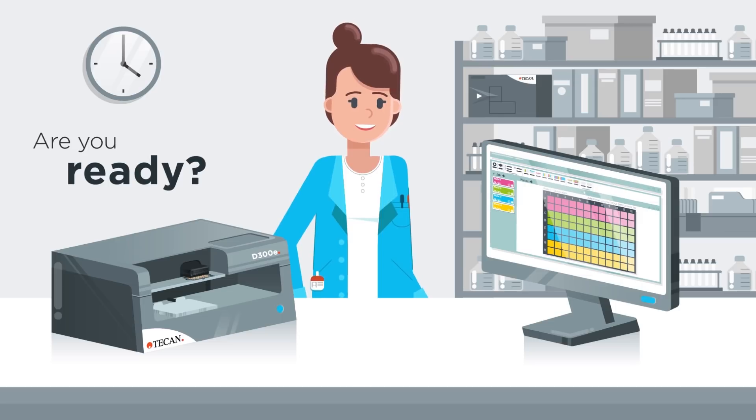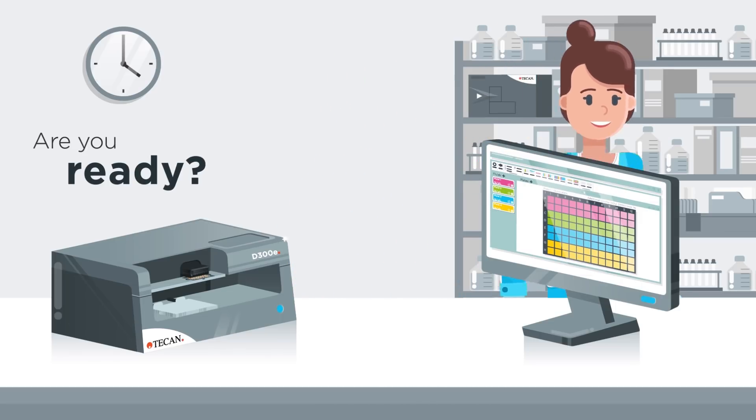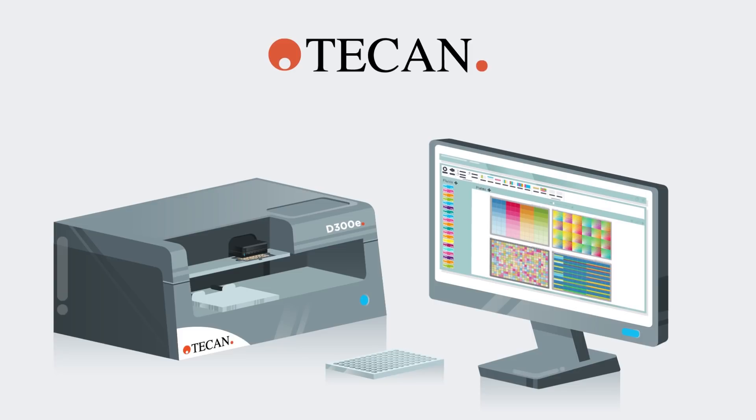Are you ready? Revolutionize your workflows with the Tecan D300E Digital Dispenser. Learn more at www.tecan.com/D300E.